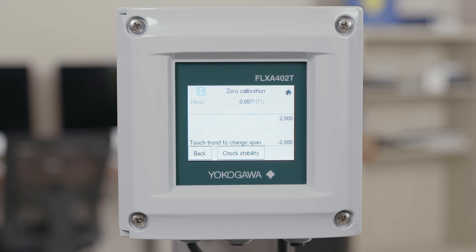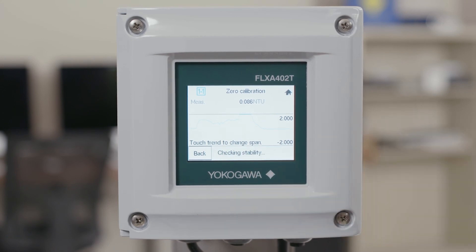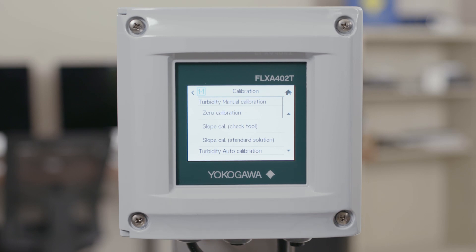Looking at the display, watch your NTU value and wait for it to stabilize. Once it's stabilized, go ahead and press check stability. Once the next button has appeared, go ahead and press next. This will then calculate your zero point and show you a new measured value. If this measured value is acceptable, go ahead and click accept and your zero calibration is complete.